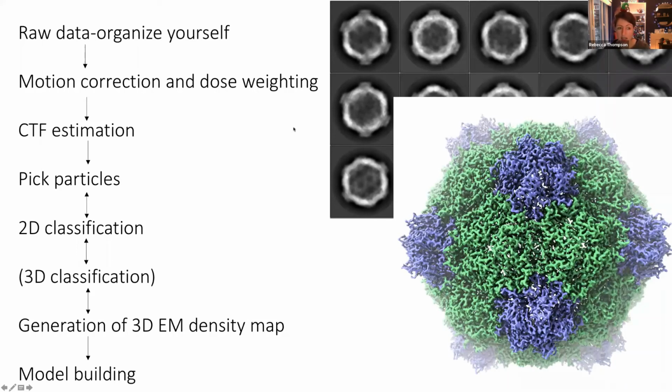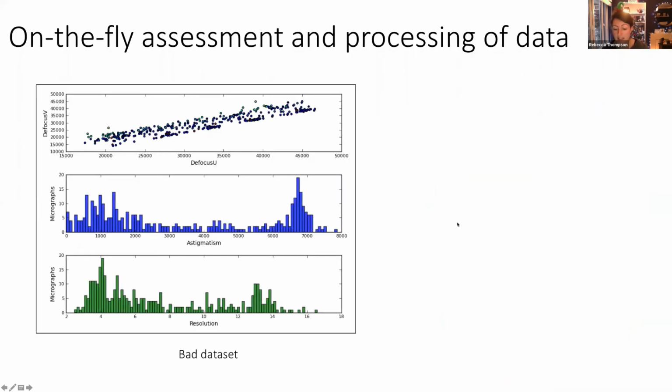I just wanted to highlight a couple of parts of this process. And the first one is what we call on-the-fly assessment of your data.